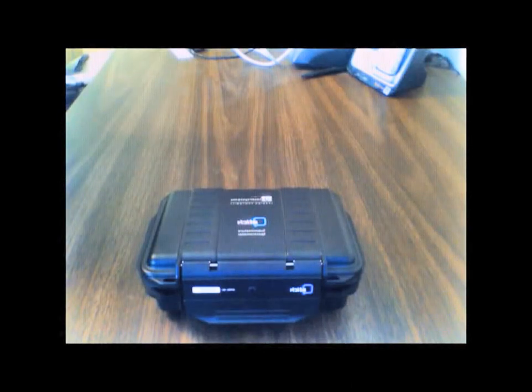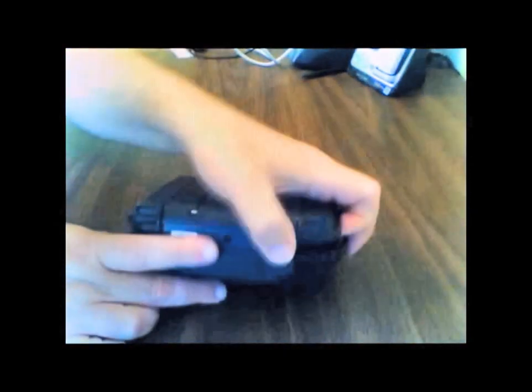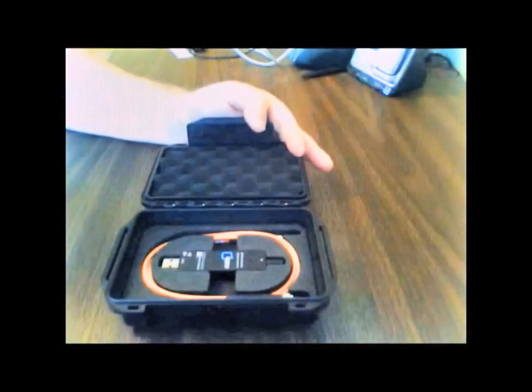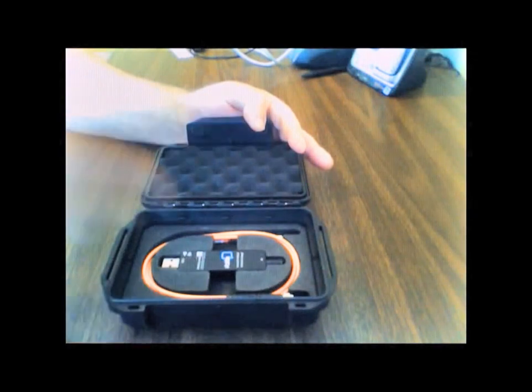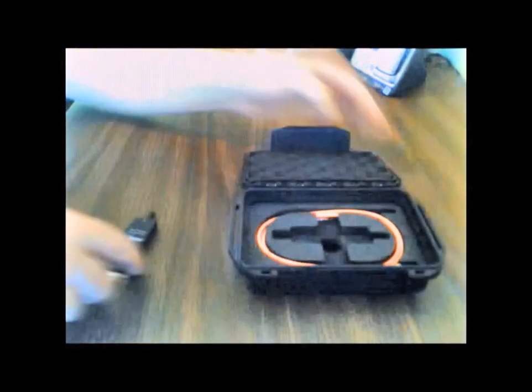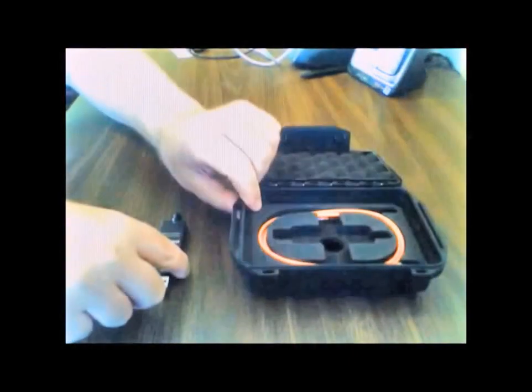This is how the Q-Stick arrives, in this rugged waterproof case. You just open it up here — very easy. You can see the Q-Stick in the middle, and the fiber optic cable wrapped around in the custom mold casing. We're just going to take the Q-Stick out and do some size comparisons so you get a sense for really how small the Q-Stick actually is.